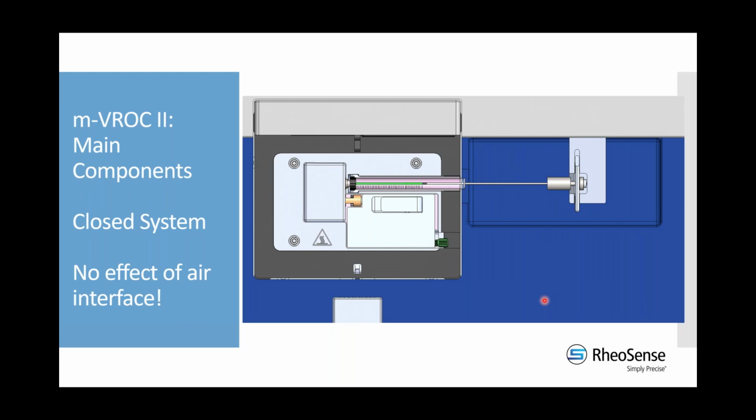The final retrieval is called recovery, in which the system will recover the sample into the syringe. This way, you can save your precious sample and use it for further characterization. Up to 80% of the sample can be recovered. Please note that after recovery, you may see bubbles or foam at the tip of the sample or at the meniscus, especially for samples that stabilize bubbles, like protein samples, because the system tries to recover the sample as much as it can.